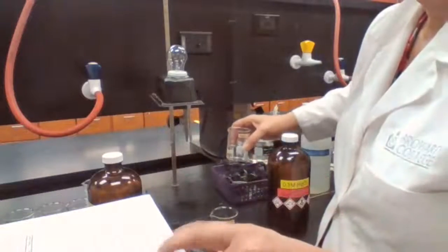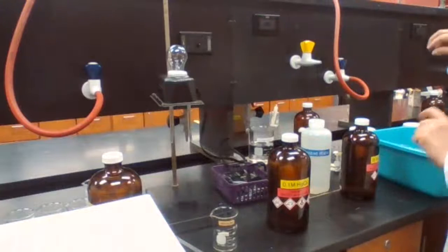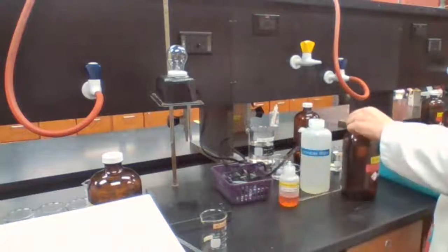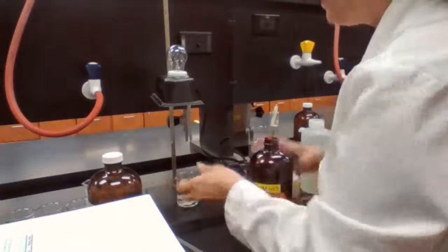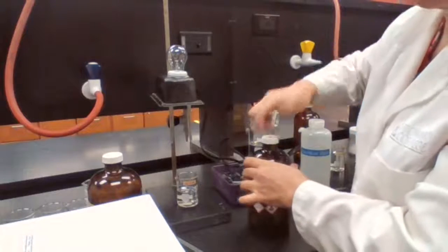Next, HCl. What do you expect from HCl? You think it's going to be electrolyte or not? What's the question you have to ask yourself? HCl is hydrochloric acid.